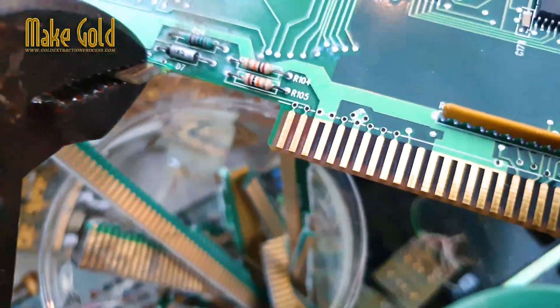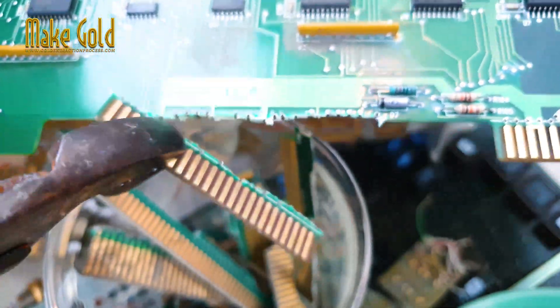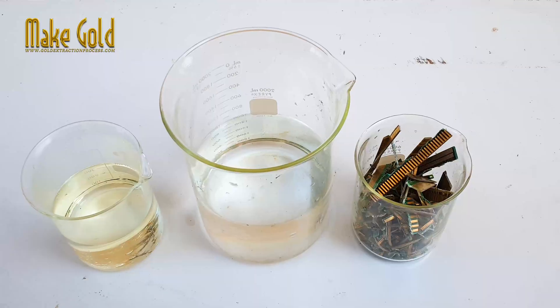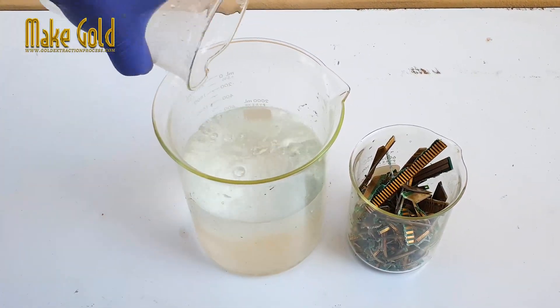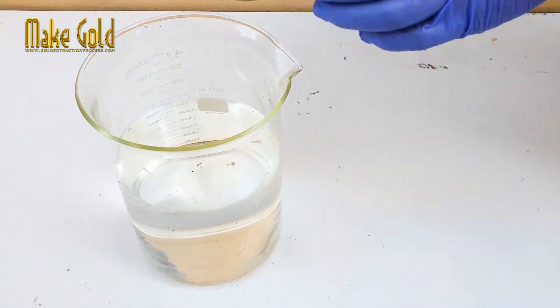Wear appropriate personal protective equipment (PPE), including gloves, eye protection, and a respirator. Disassemble the circuit board and remove the gold fingers. Use 68% nitric acid mixed with water in a one-to-two ratio, then put the PCB gold fingers into the nitric acid mixture.